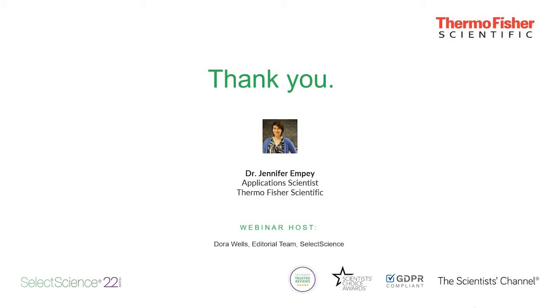Thank you. I have another question here. What is the LOQ sensitivity of this method? Yeah, so I don't have a specific LOQ right now to give you for this experiment. I can try to look at that data again to give you that information.